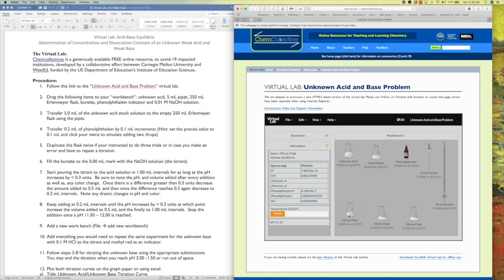And what you should have done, as I was telling you, as you are adding volumes, is accumulate all these measurement data of the pHs at each of those volumes that you added. Now, if you've made a mistake, what you can do is empty this burette.